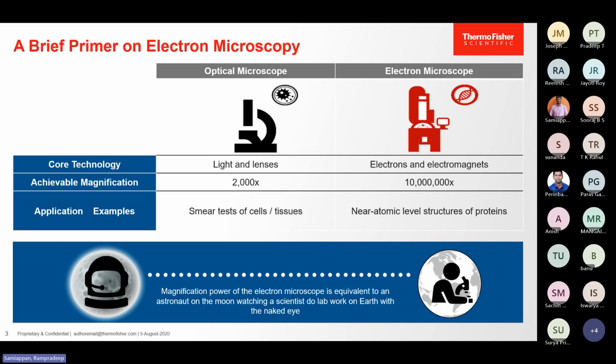And then we have a specimen with different contrast. Of course, we can achieve huge magnification, and we can also try to solve atomic level crystal structures of biological samples, especially proteins. Since I have worked on proteins and membrane proteins, it is a very tricky and complicated process, but the latest sophisticated equipment can help us to achieve that atomic structure.